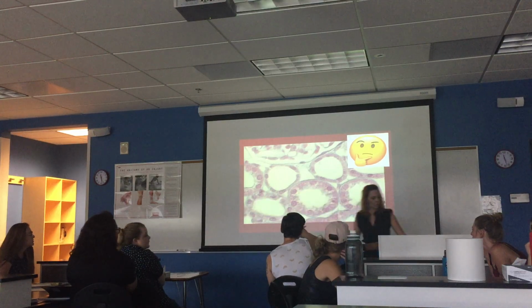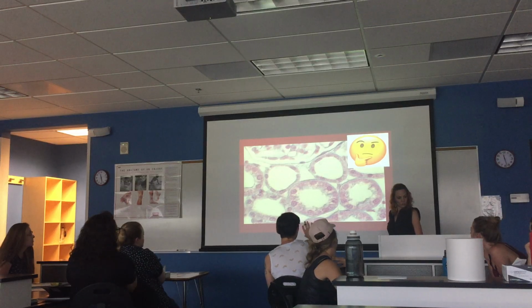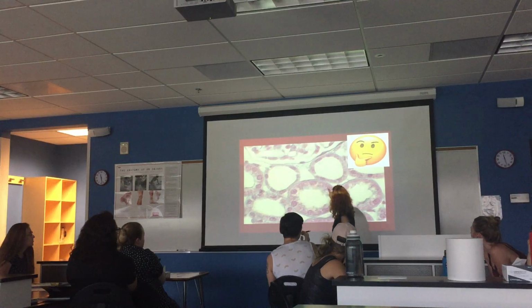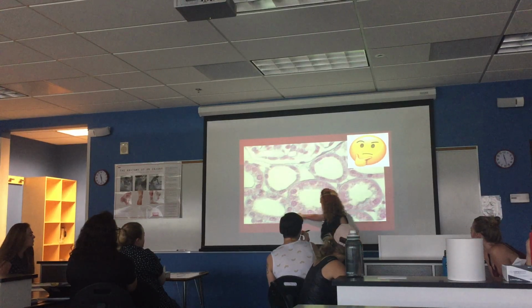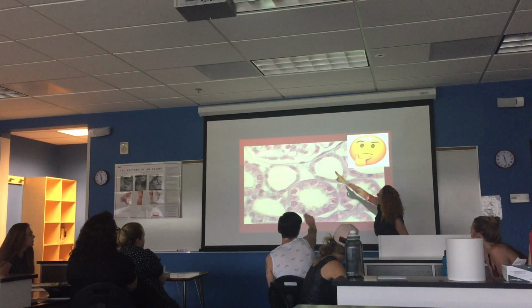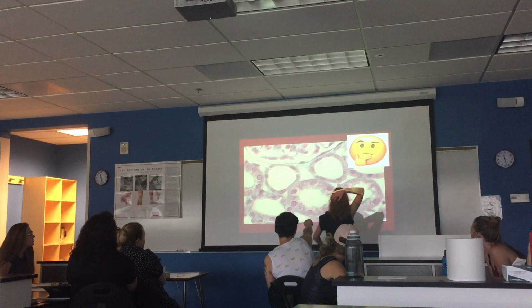Yeah? How come it looks like stratified? It looks like multiple layers. There are not multiple layers. 1, 2, 3, 4, whatever. Where's our multiple layers? Oh, never mind. I was thinking of bigger. Up there? Yeah, that's tissue we're not caring about right now. Like the bigger structures that the cells are within.